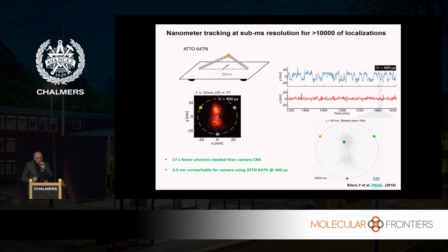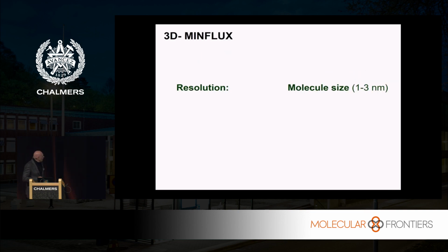You can get the movement within a short period of time with very high, nanometer precision. No way to do that with a camera, because with a camera you have to wait until 1,000, 2,000, 10,000 photons come in order to find out the position. But here, using this donut that already defines a position and using the fluorescent photons only for refinement is so fast. This will open a new area of application.